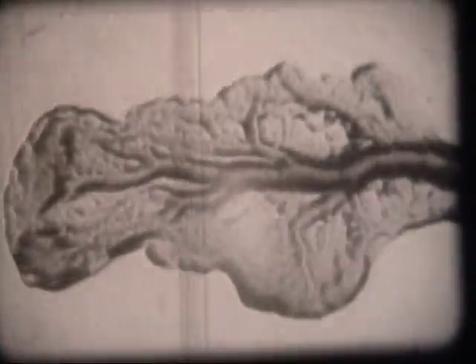What you see is the same protoplasm, but now speeded up by time-lapse photography. The rhythmic period of the pulsation is, as one would expect, the same as that of the rhythmic flow. Here's a primitive heart, one drop of protoplasm pulsating out, in, out, in. If the theory is a really good one, it should fit all cases.